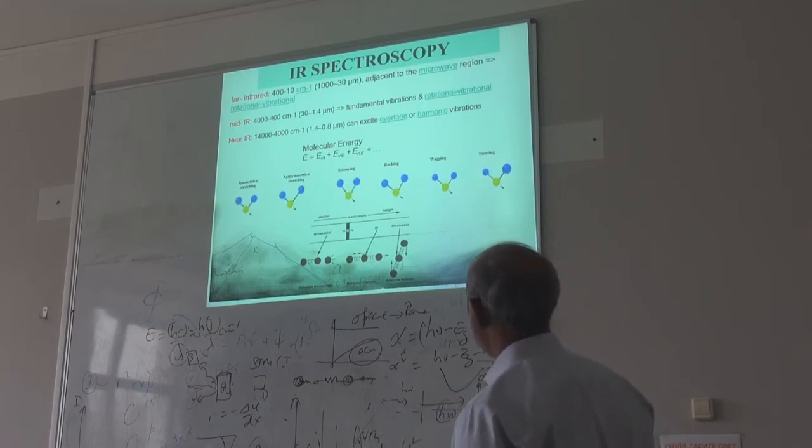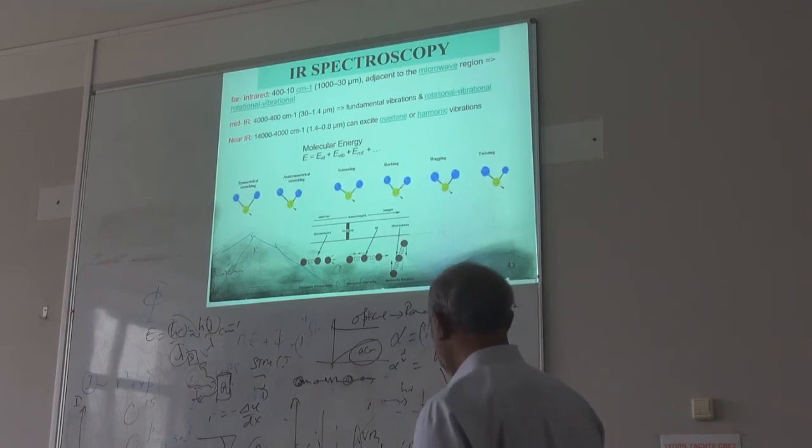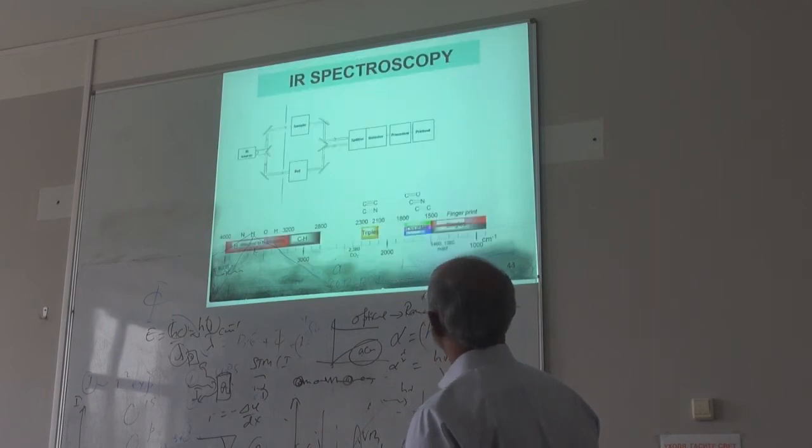So they all are infrared active spectrum. In a typical spectrometer, you have, again, an infrared source, then the sample, then you have a reference source, then we are looking at the difference between the two.